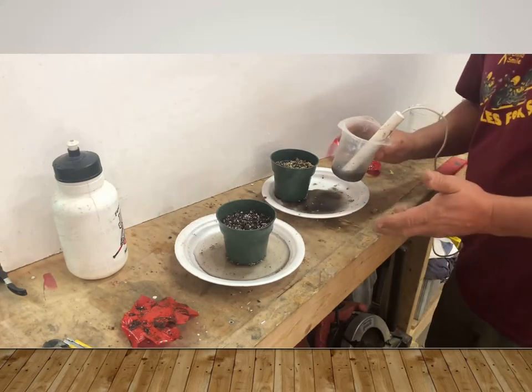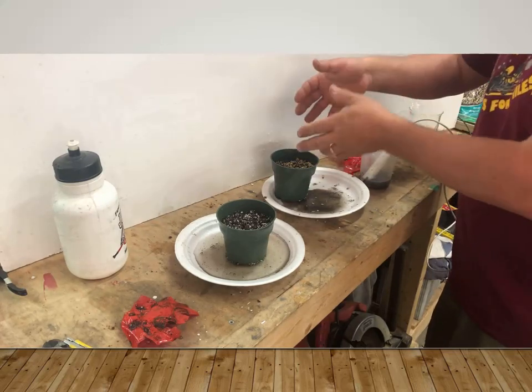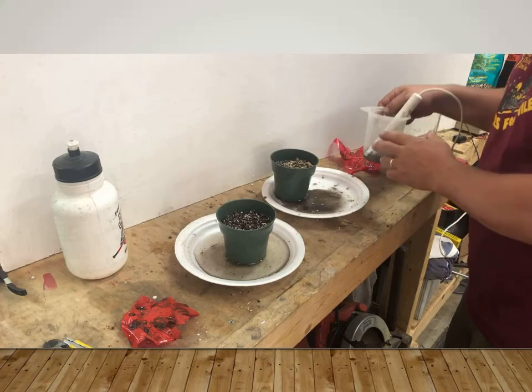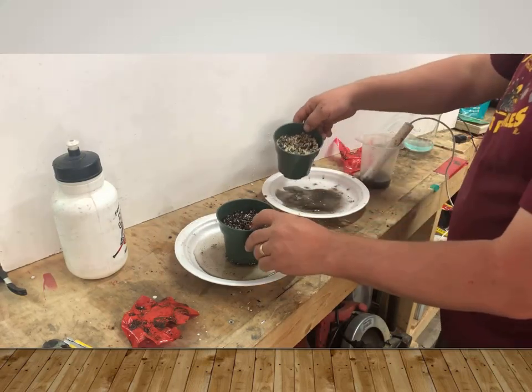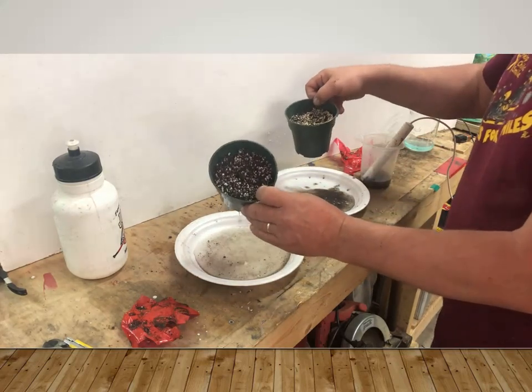An EC of 3. So what's happened is the vermiculite has held on to those cations in the fertilizer solution. Now the anions will continue right on through, so you're going to get some higher salt levels. But what we've done here is we've improved the cation exchange capacity of peat moss by adding vermiculite.